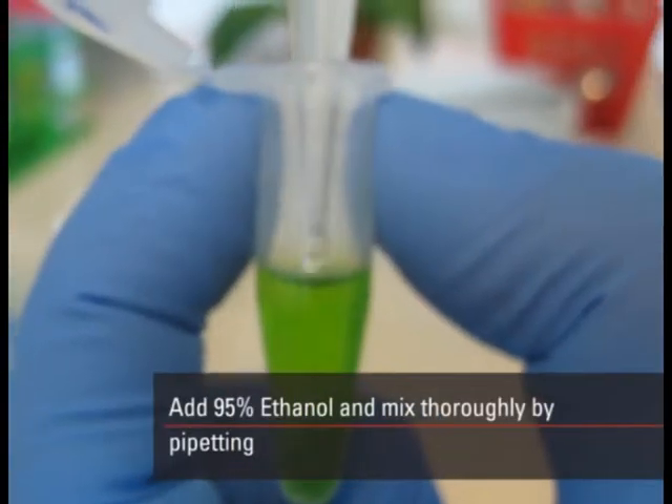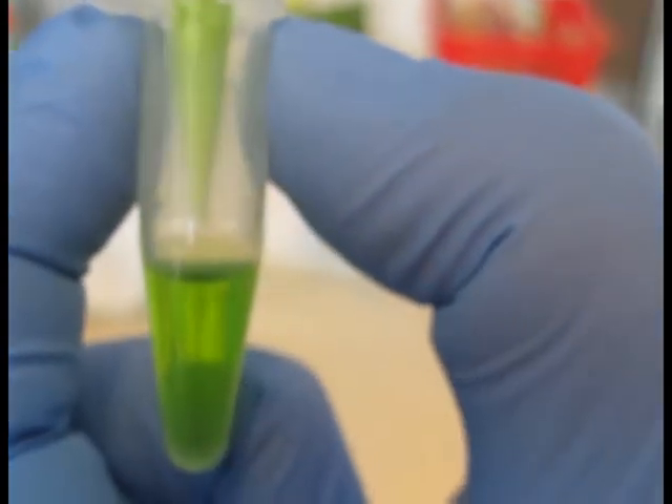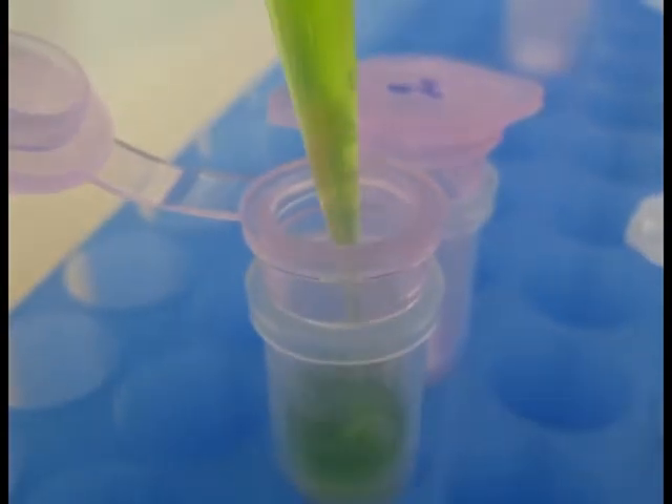Add 95% ethanol and mix thoroughly by pipetting. Apply on a spin column. You can also use a magnetic bead purification protocol if desired.